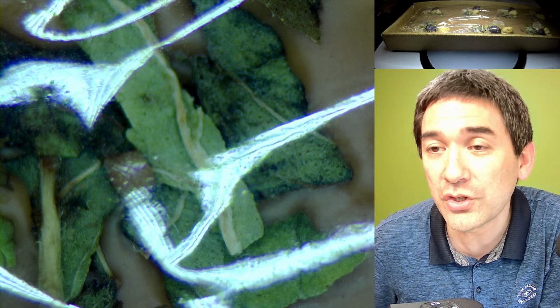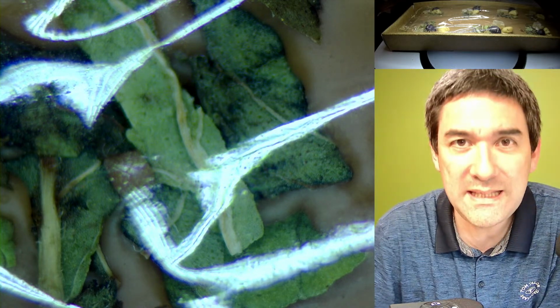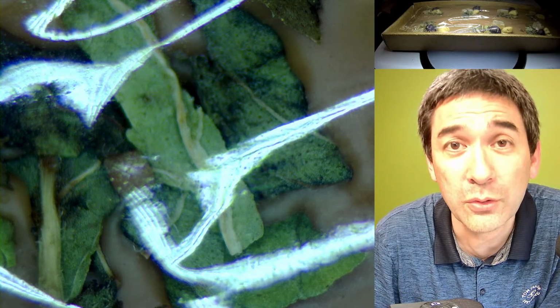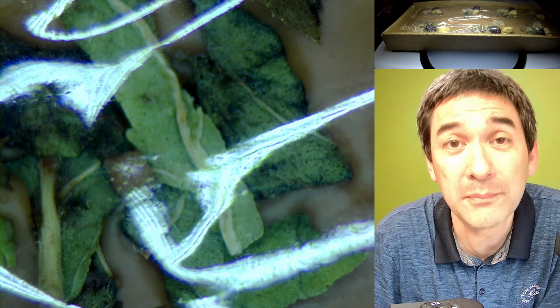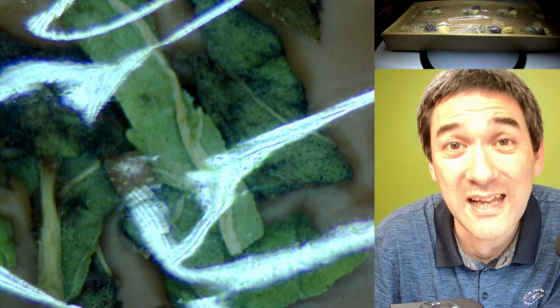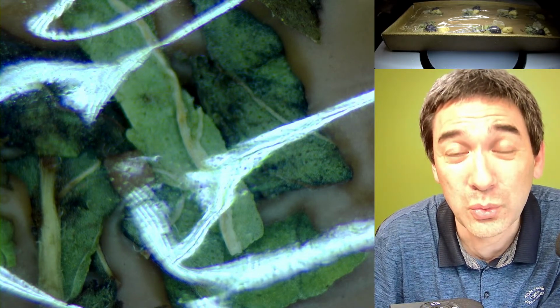Again, some of the questions. I hope I'm not going to overlook something here. I'm planning to cut a thin layer of the insect after freezing it to minus 20 degrees. In my mind, I was thinking it would be easier to cut. Yes, as a matter of fact, this is sometimes done. Objects that are difficult to cut can be frozen, but you have to be aware that if you want to cut it, like microtoming it, it might be a little bit difficult because the insect's exoskeleton is so hard.